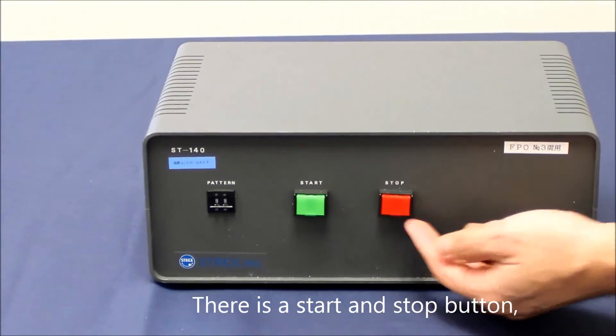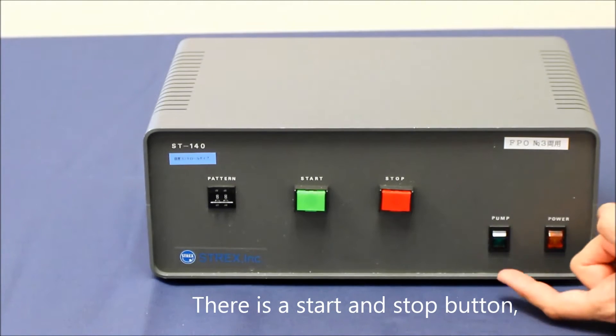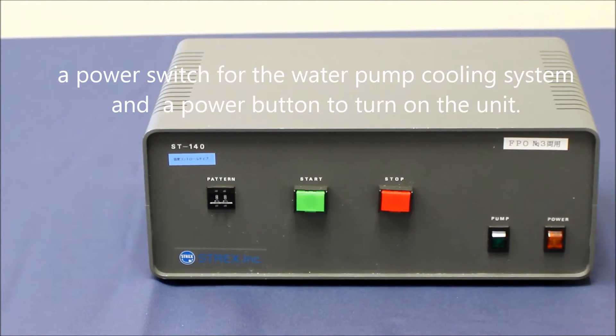There is a start and a stop button, a power switch for the water pump cooling system, and a power button to turn on the unit.